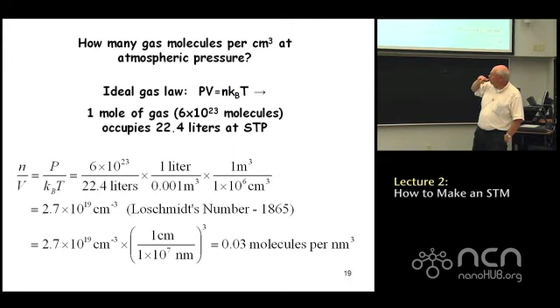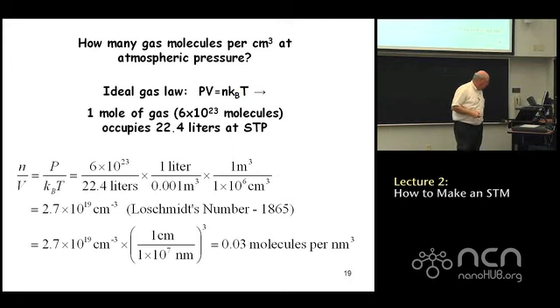So in a volume that's given by 0.3 nanometers cubed, you'll find out that there are very few atoms that are actually located in that volume where the current is localized during the time it takes the electron to tunnel from the tip to the substrate, right?